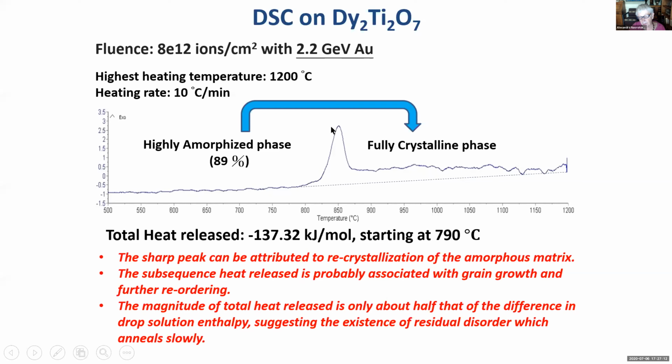We would have liked to do more studies, but again, even with the Darmstadt irradiation of samples, the amount of sample one has is limited, so we could not immediately go back to this. But nonetheless, this peak accounts for about 1/3 of the total damage energy in the sample. This whole peak maybe accounts for about half.